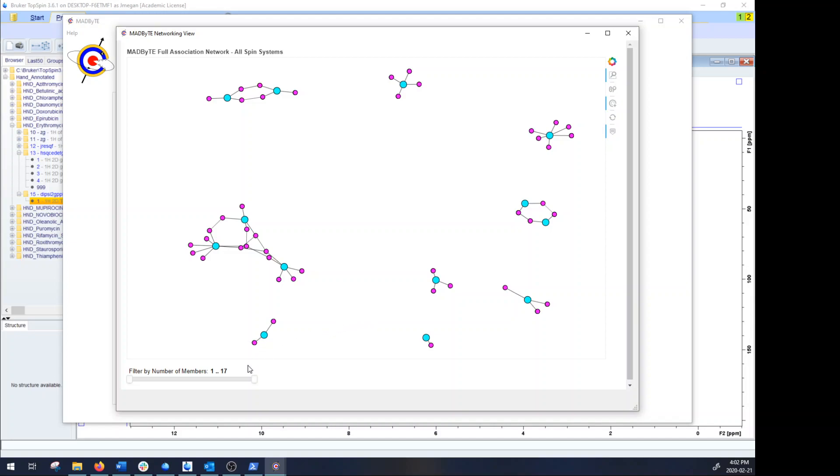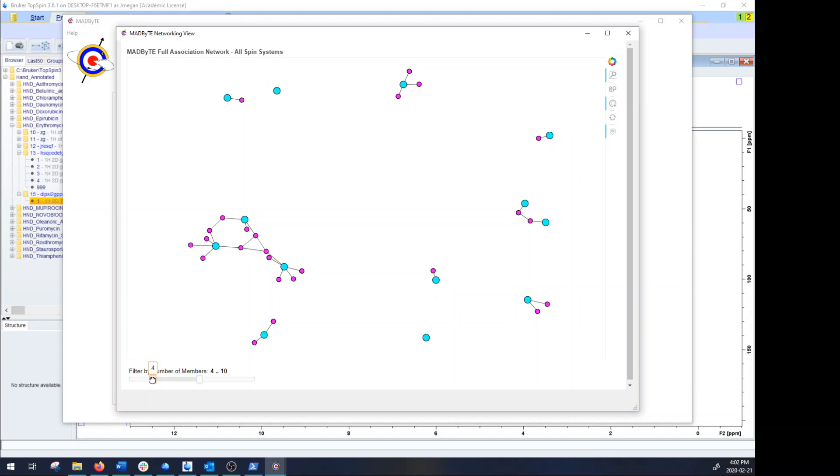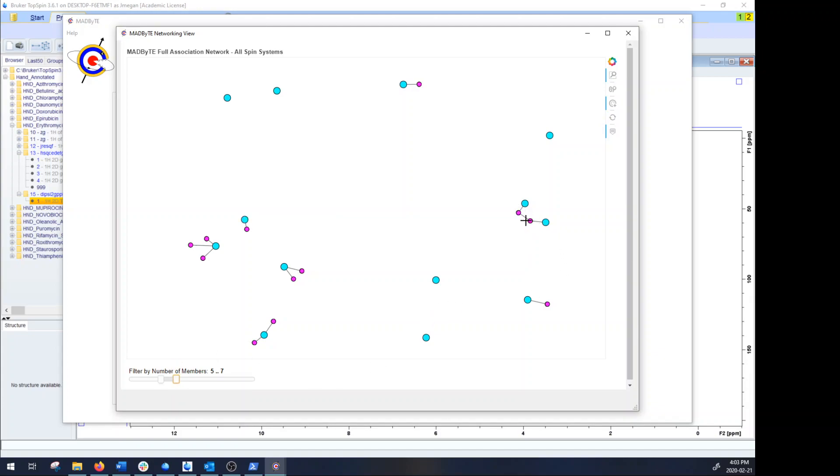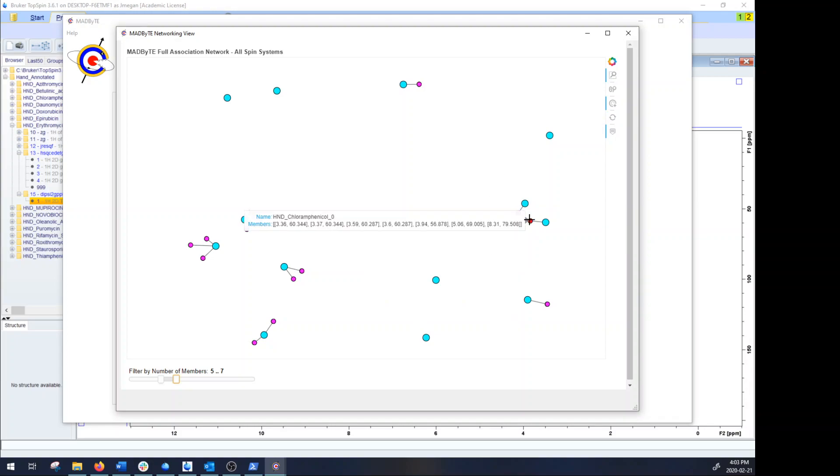One of the features of the network is being able to actually filter based on size. So you remember how I was saying sometimes you get a very large network. Well if you didn't want to see that you could simply drag this and you could start to see the larger networks by doing the exact same in the opposite direction. So if you wanted something that was at least five members long, five or seven members, you could start to see the shared characteristics between two different extracts that are pretty heavily conserved scaffolds.